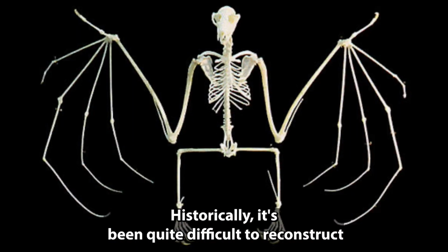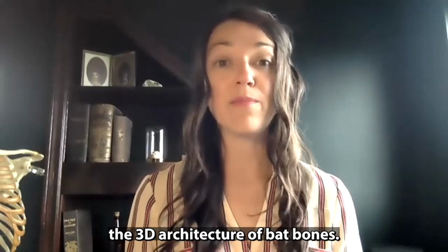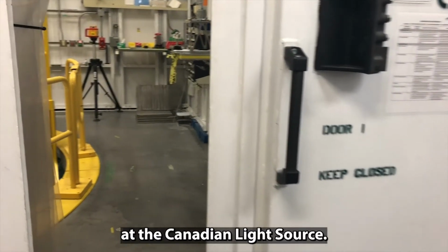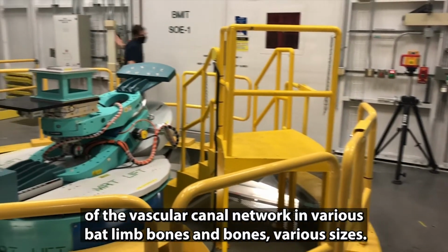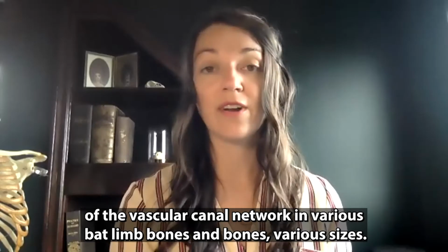Historically, it's been quite difficult to reconstruct the 3D architecture of bat bones. So our team used the biomedical imaging and therapy beamlines, or BMIT, at the Canadian Light Source. Using the synchrotron, this uniquely allowed us to create a full three-dimensional map of the vascular canal network in various bat limb bones and of bones of various sizes.